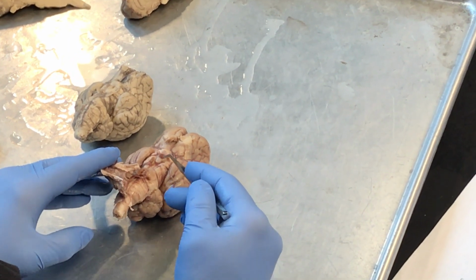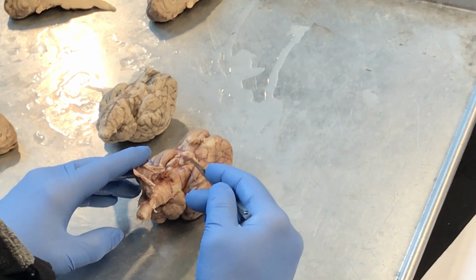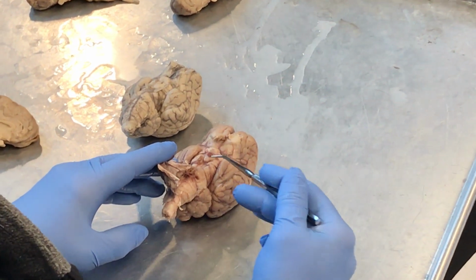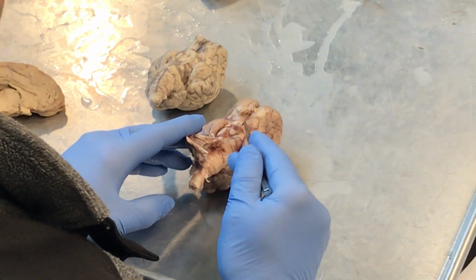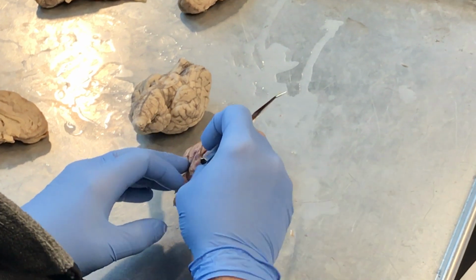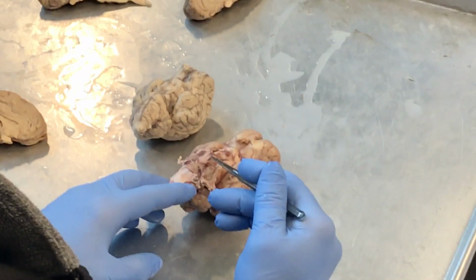Why do they call it mammillary body? Well, in sheep you can't really tell, but in humans, there's actually two bulbs that sit here on both sides, and they look like small breasts, hence the term mammillary body. This is where the infundibulum is. It's the stalk that connects the pituitary gland. And by the way, the pituitary gland is this right here. That's pituitary gland.